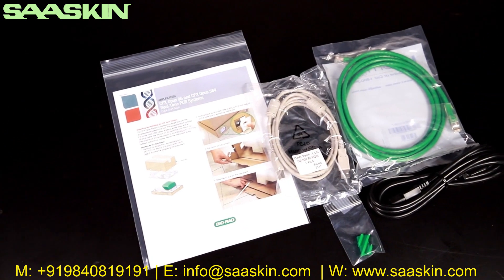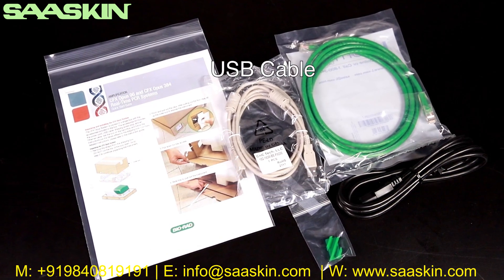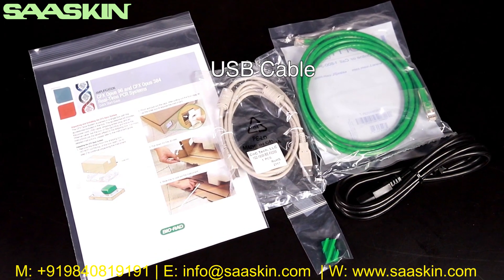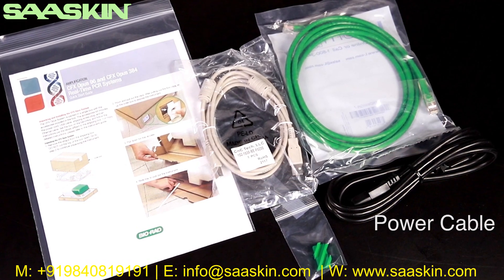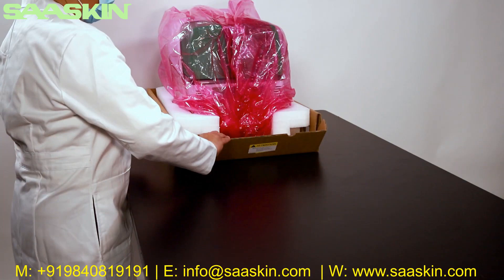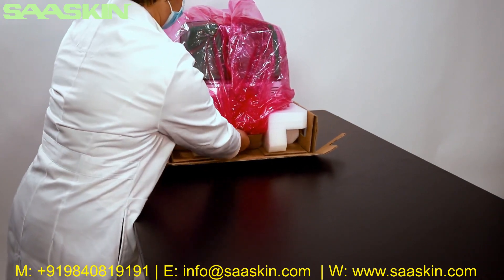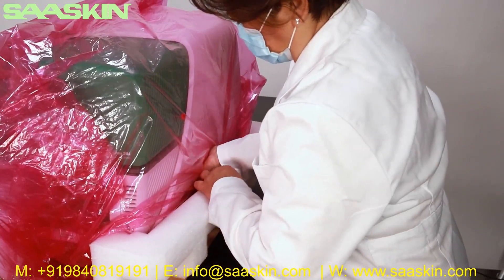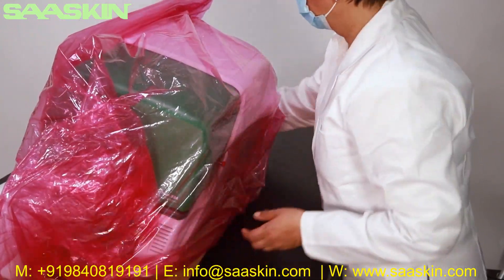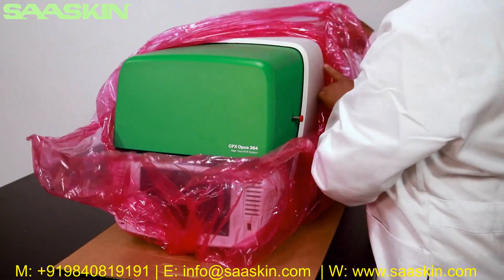Remove any protective foam on top of the instrument, then remove the plastic bag of accessories. The accessories bag contains: the quick start guide, safety manual, a USB cable for connecting to a PC running CFX Maestro software, an Ethernet cable, and the power cord and shipping plug. Pull down the flap on the cardboard base and slide the inner tray with the instrument onto the bench. Rock the instrument to each side to remove the protective foam underneath.